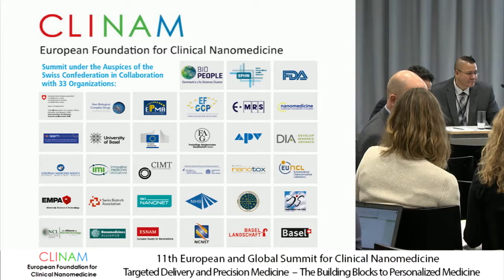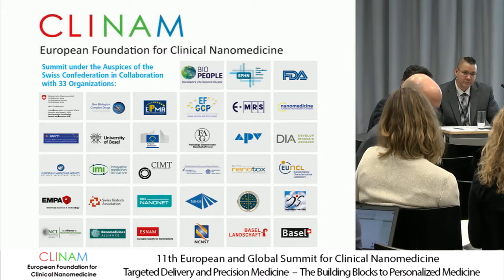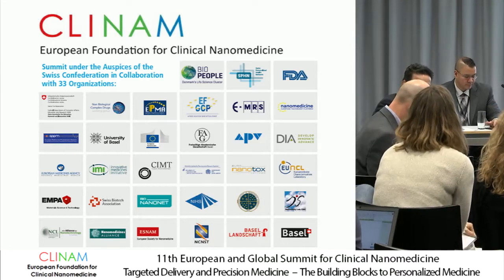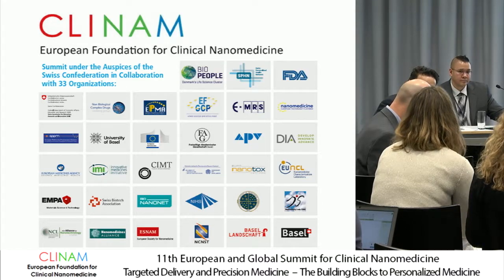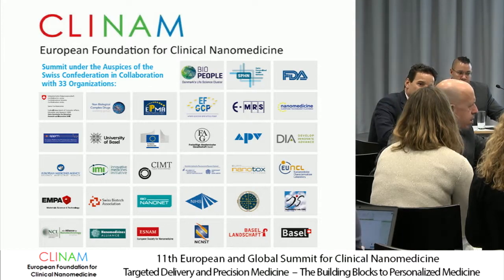It is very true, and as he said, from the manufacturing perspective, you can actually spike your sample and do a simple measurement as well. In some cases, we work with samples that just need to be spiked, and you look at the relative difference. You can look at the thermal drift. So there are a lot of techniques that have to do with simple measurement.